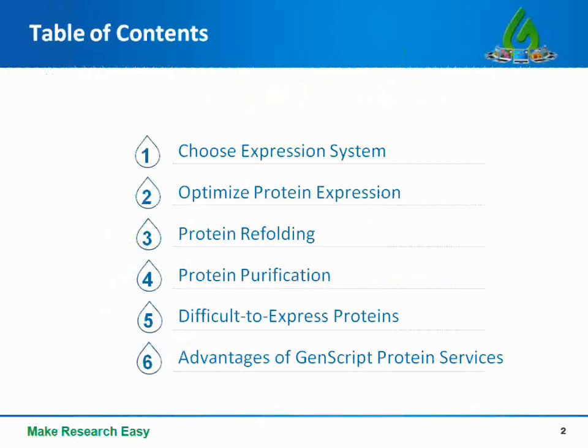Here are the topics that I will walk you through in today's seminar. When you have a protein expression and purification project, you may face a series of decision points. The first one is to choose the expression system. In this section, I will go over what to consider when choosing the expression system and what the advantages and disadvantages are for each expression system.